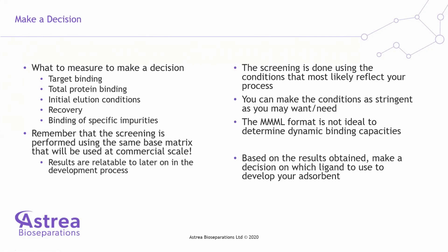One caveat that I like to make is that the format is not ideal to determine, of course, dynamic binding capacities because you are not regulating flow. So you have to be careful with the results and try not to overinterpret the results in terms of capacity, especially dynamic binding capacities, because the numbers that you get there are not the real numbers for the optimized adsorbent.